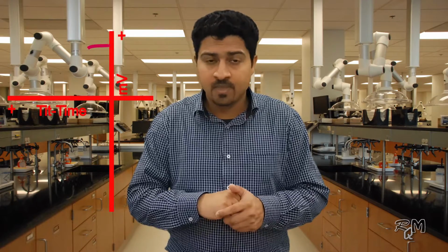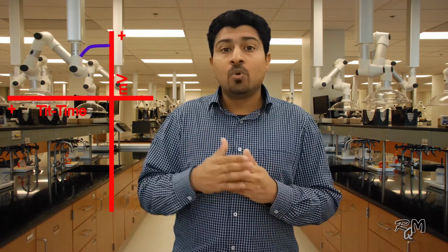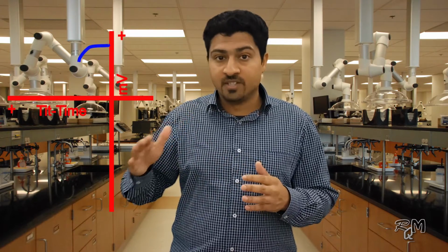When the titrant pump starts, for 2 to 4 minutes, the millivolt reading decreases very slowly towards the negative side. After continuous injection of titrant, the millivolt rate of change starts to increase. And one point will come when the millivolt reading rate of change becomes so high that you cannot count it by mouth. In fact, this is the auto endpoint of titration to calculate calcium concentration.